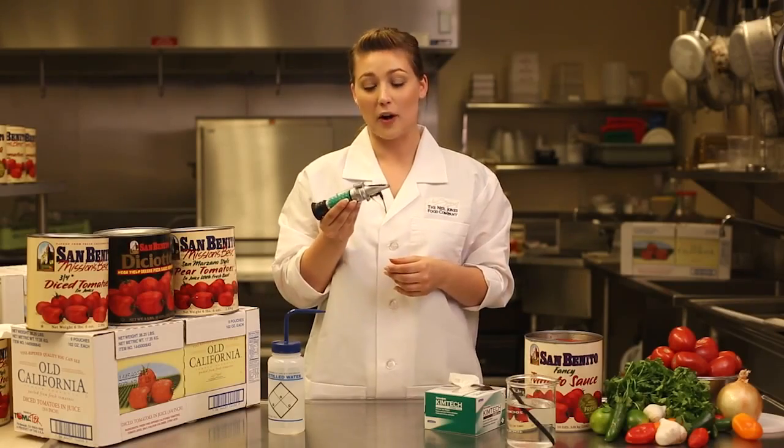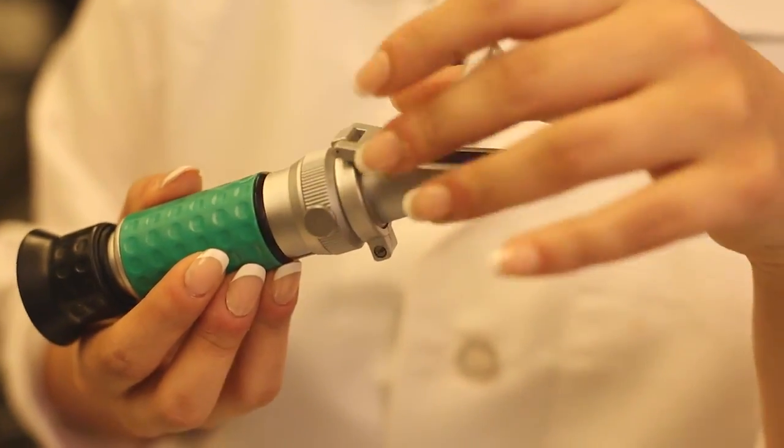Analog refractometers like this one are made up of the main prism and the daylight plate located at the end of the unit.